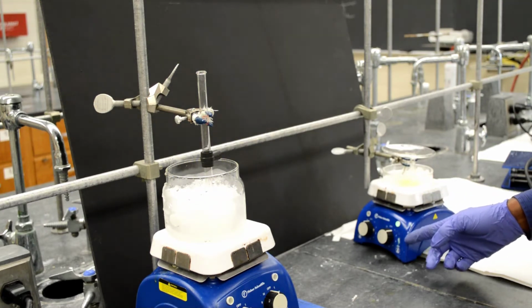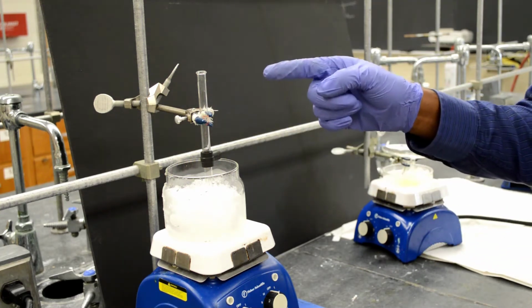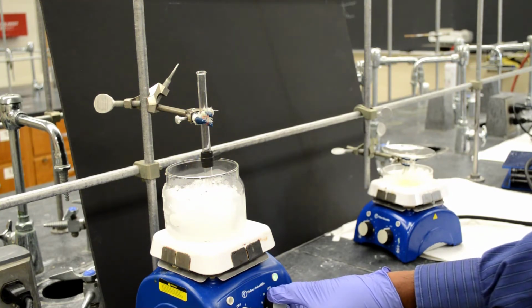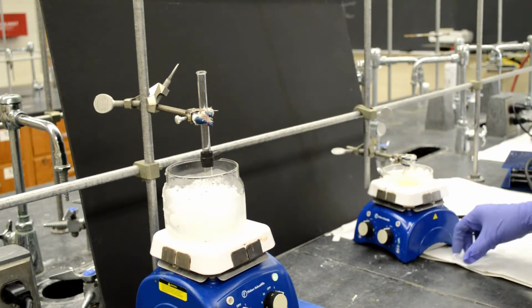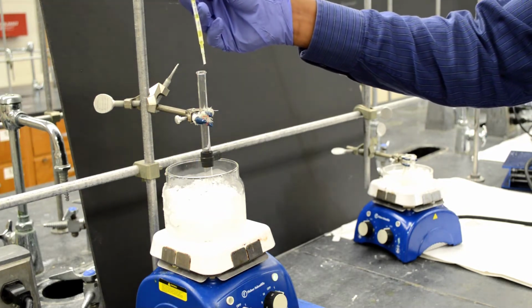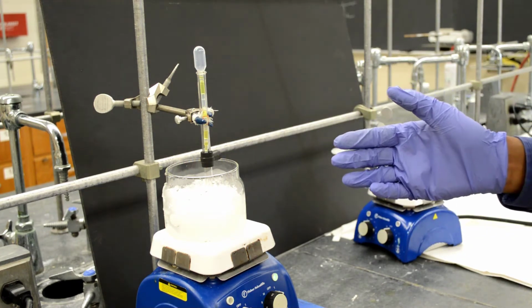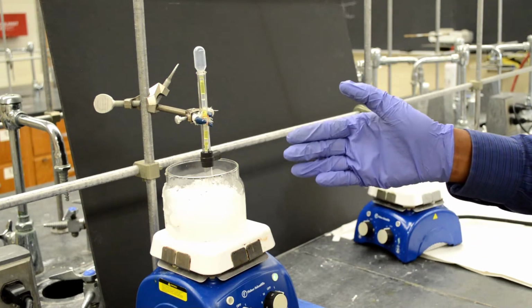After mixing the sulfuric acid and nitric acid, let's add the reagent dropwise into our methyl benzoate. So let's turn on stirring for the methyl benzoate, and I'm going to use a plastic dropper. Take this mixture of nitric acid and sulfuric acid and add dropwise, 1 drop at a time for the next 15 minutes. So it's a very slow process. Again, this is to contain the exothermic reaction.